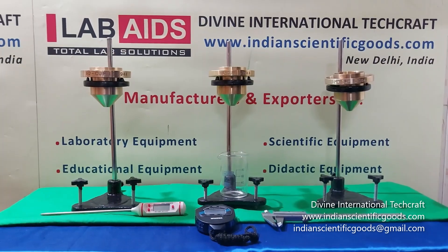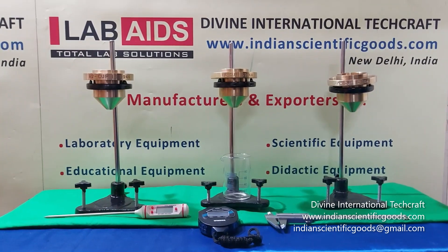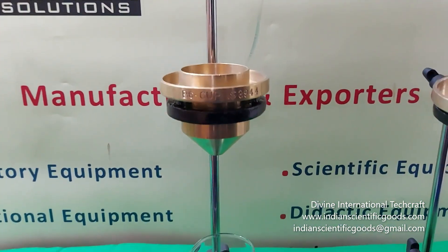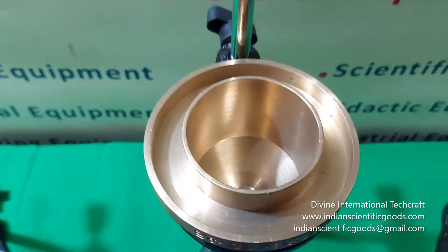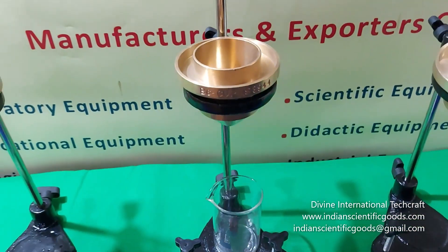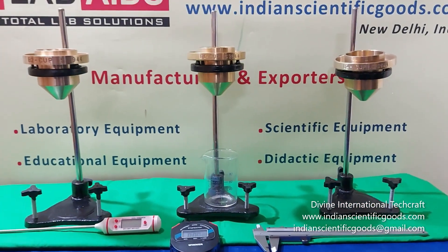Hello, these are Flow Cup Viscometers or Ford Cups manufactured by Divine International Techcraft, New Delhi, India. A Flow Cup Viscometer consists of a brass cylinder or cup of fixed volume with an orifice of specified dimension at the bottom. These are crude measurement devices used for the measurement of the kinematic viscosity or relative consistency.